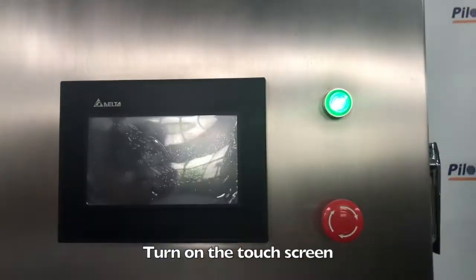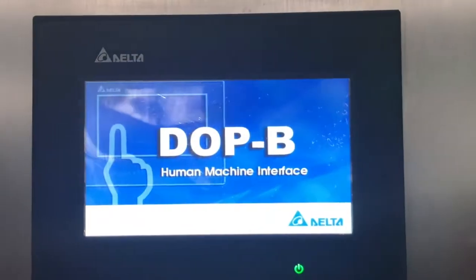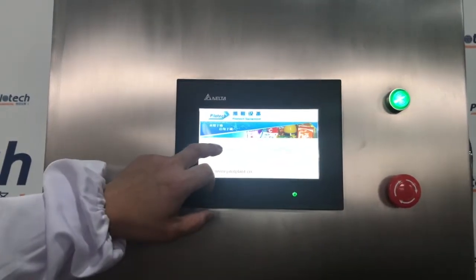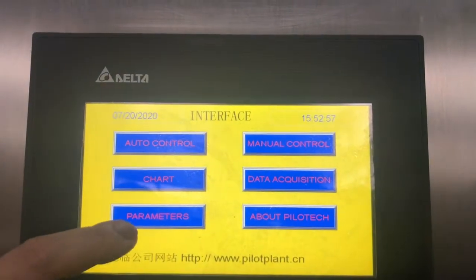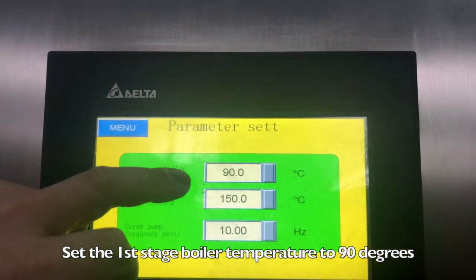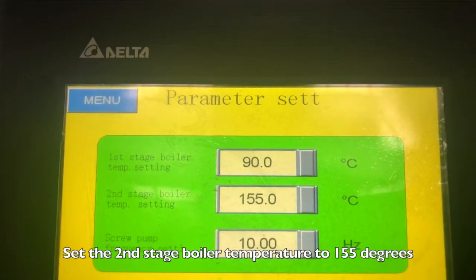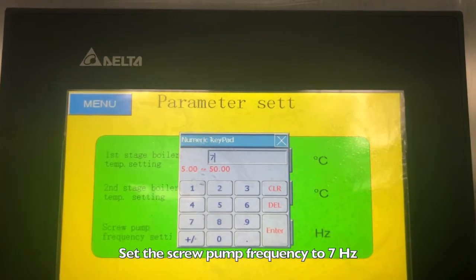Turn on the touch screen. Click anywhere on the screen. Choose parameters. Set the first stage boiler temperature to 90 degrees. Set the second stage boiler temperature to 155 degrees. Set the screw pump frequency to 7 Hz.